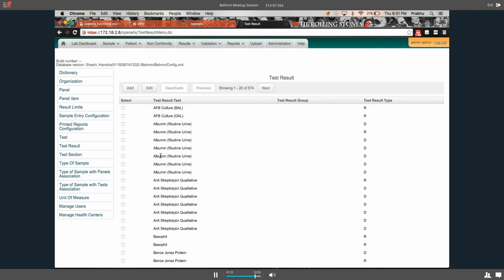Normally it's an automatic test. It's a machine-based test.